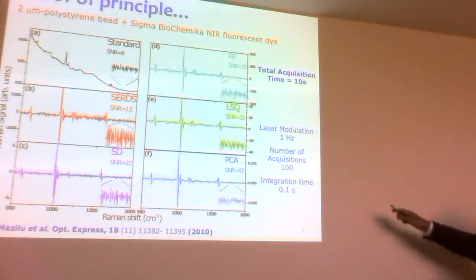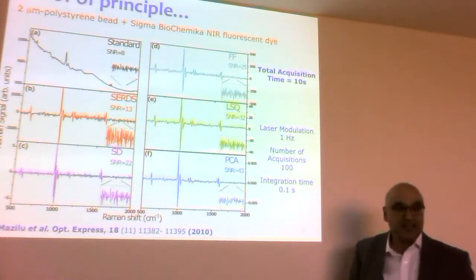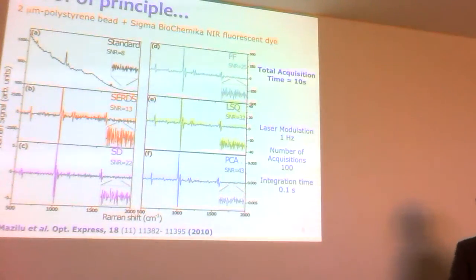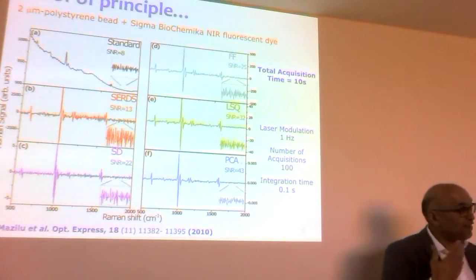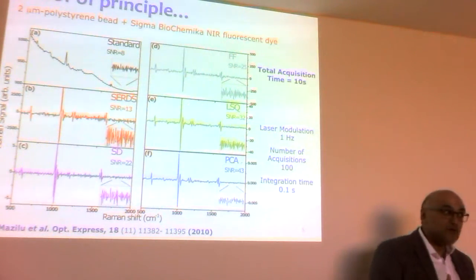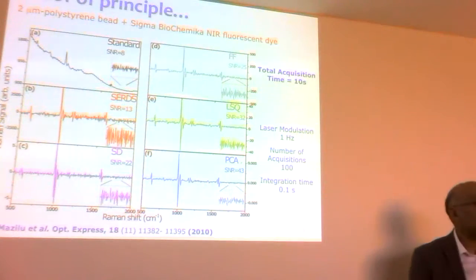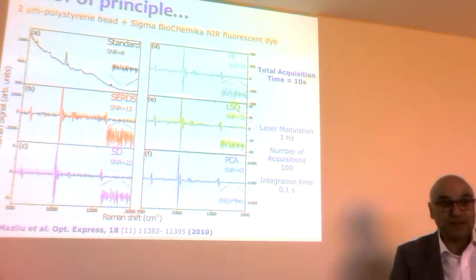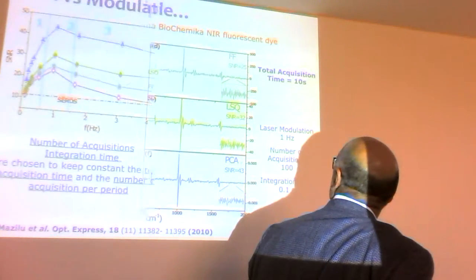But it turns out, in these numerical analyses, if you do more than one wavelength and modulate it, you amplify the signal-to-noise ratio by a factor of, well, 5 to 10, depending on your signal. That's very good, because one of the problems when you're only detecting 1 in 10^6 or 10^8 photons is how do you get that signal out? It's very, very weak. So you can reduce acquisition time here by maybe a factor of 2 to 5, depending on your sample, using that kind of approach.